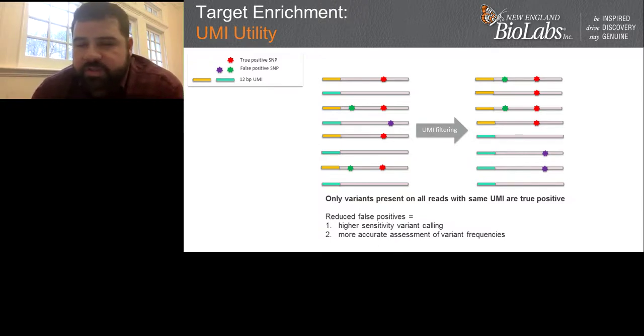And one of the questions that's come up is that PCR duplicates have always been viewed as a somewhat negative result that will happen from doing PCR amplification. We're now actually having multiple copies of these molecules present, and that is helpful because you can actually use them to derive some useful information out of that.